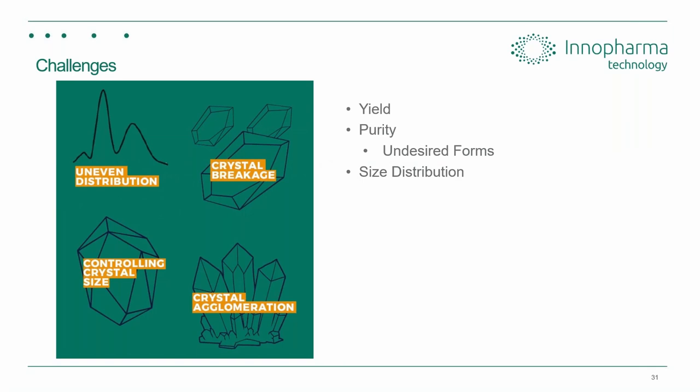So yeah, there are several reasons for an uneven distribution. One of the examples we looked at earlier on the slide was where the crystals were allowed to fall out of solution rapidly, cooling in air, and you get a crystallization that's not homogeneous. Small crystals form as well as large crystals. The smaller crystals can clump together to form agglomerates, but when the speed of nucleation isn't controlled, what results is an uneven distribution of end product through agglomeration and different forms being present. The question was whether the freezing of boiling water is an ideal crystal process.